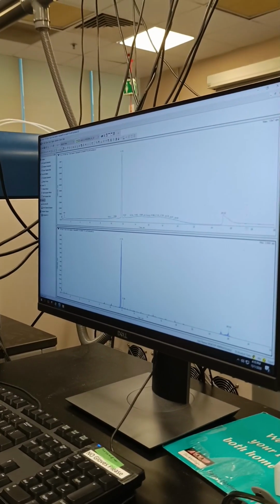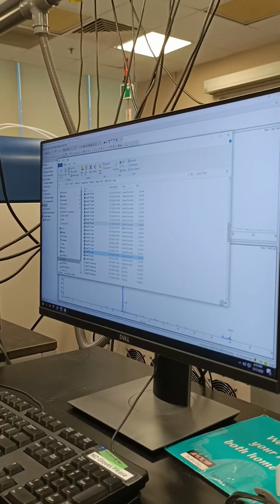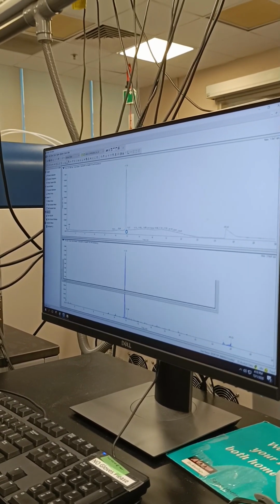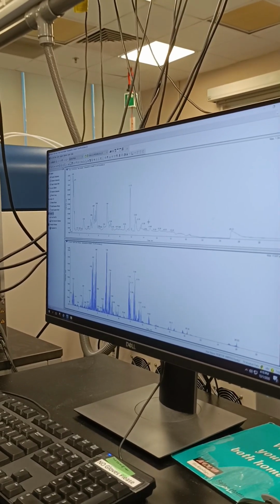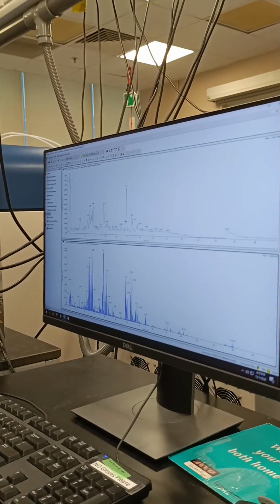Okay, so I will just show you one example. Maybe start with the blank samples, because my blank is actually 70% methanol. So you can see the background is as bad as this. It's only like one peak, two peaks. So this is the blank. But if you look at a proper extracted sample, you should see a lot of peaks like this. It still shows you the peak height, so you can quantify for peak height. You can actually, if I have a standard.